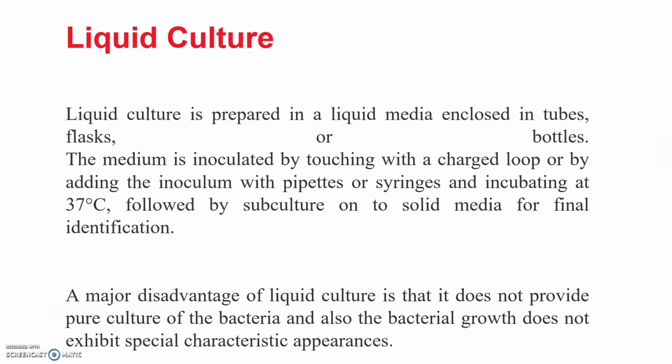Next is about liquid culture. Liquid culture can be prepared in a liquid medium and it is enclosed in tubes, flasks or bottles. The medium is inoculated by touching with a charged loop or by adding the inoculum with pipettes or syringes, and incubating at 37 degrees Celsius.